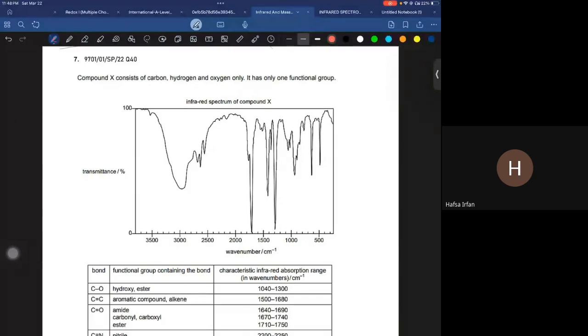So this peak, this peak, this peak is at 1600 and then 1710. Again, this is at 1710. This peak is the broad peak basically. So you can say okay, it's 2800 से लेकर 3300 तक. Okay. Right.